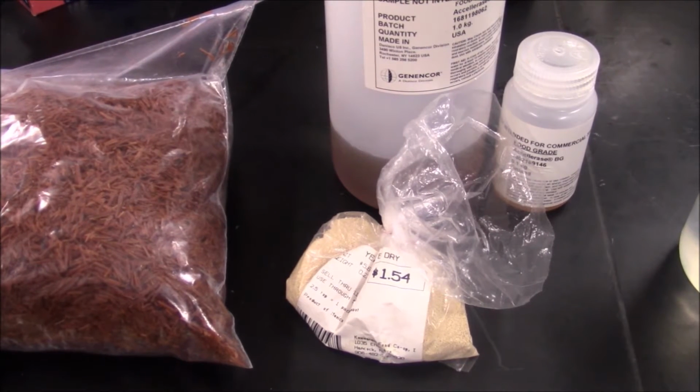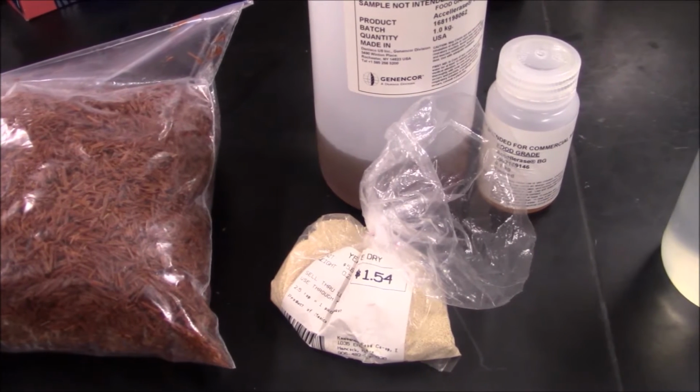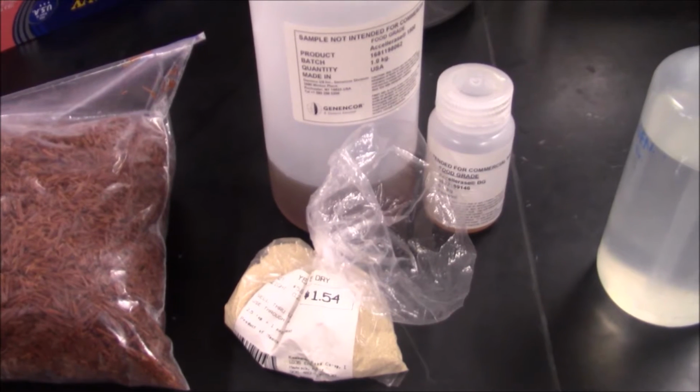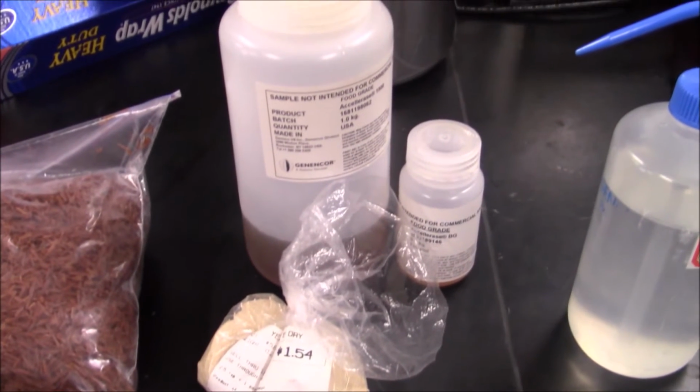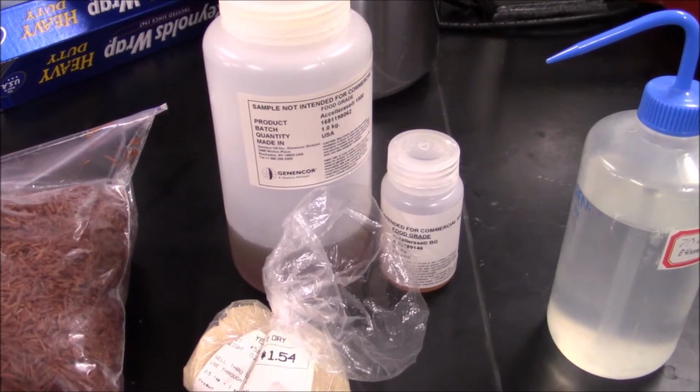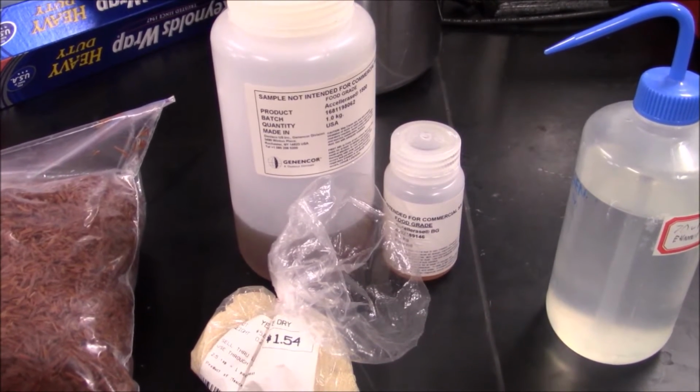During the first stage of this experiment, the cellulose in the wood chips is broken down and converted into glucose by the enzymes Accelerase 1500 and Accelerase BG. The glucose is then consumed by the yeast, and ethanol, water, and carbon dioxide are produced.